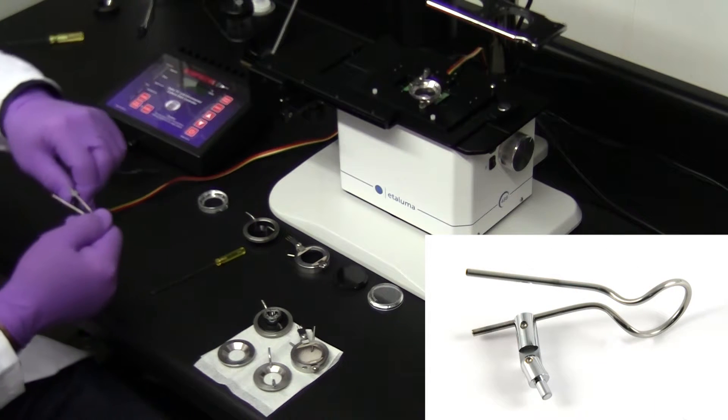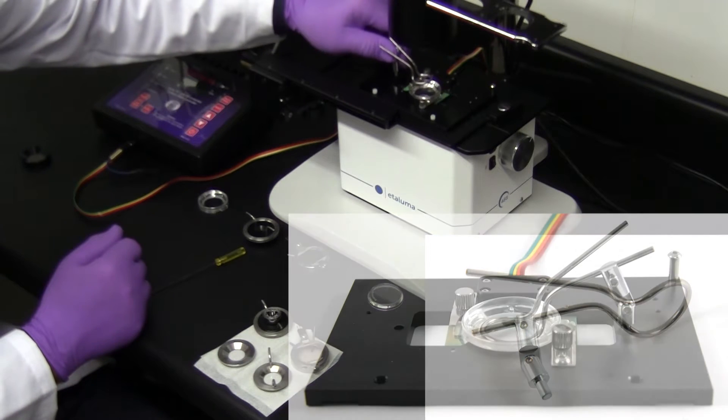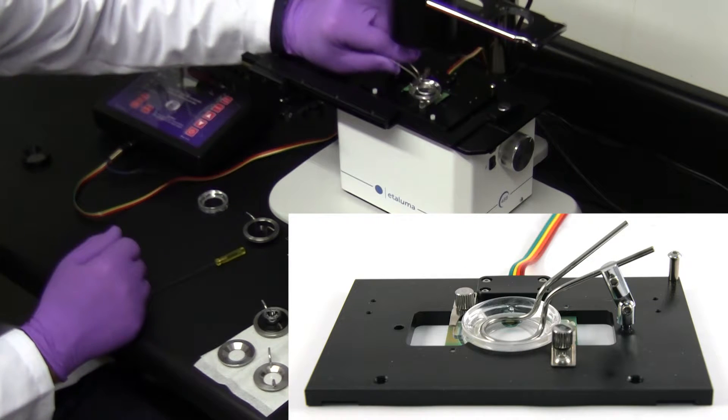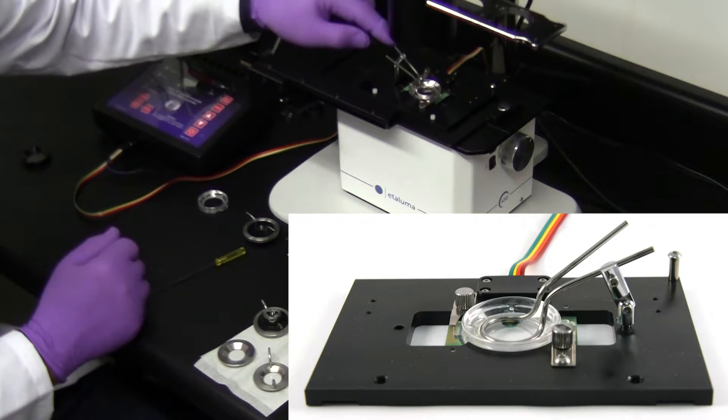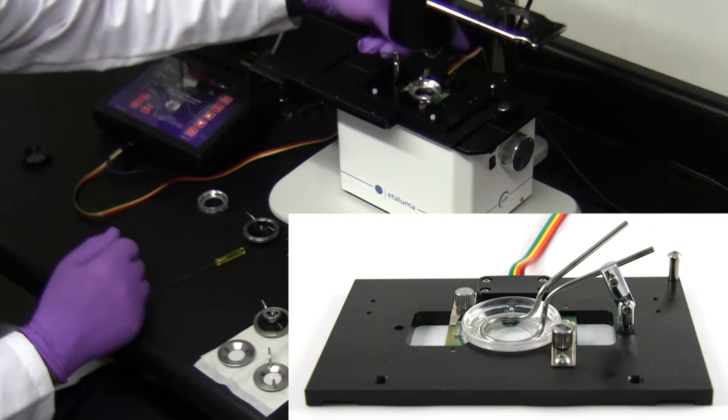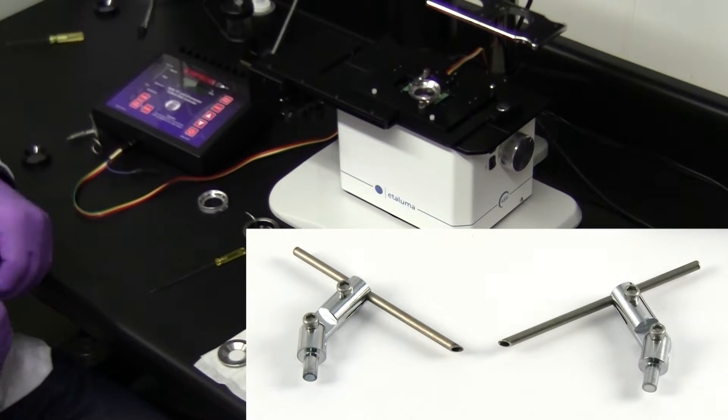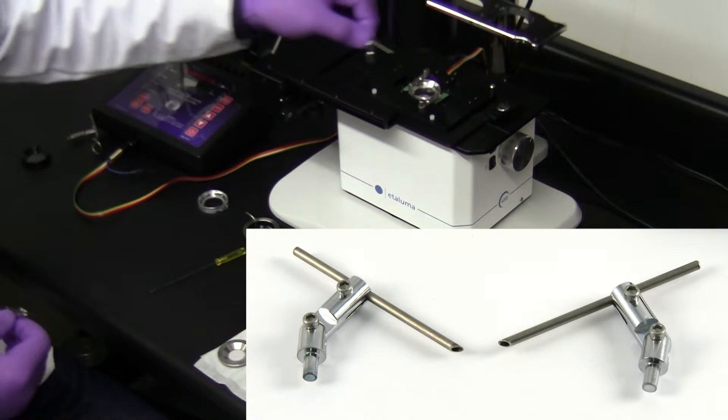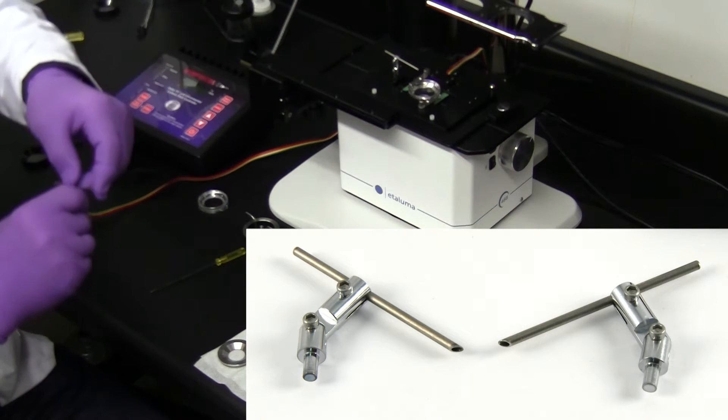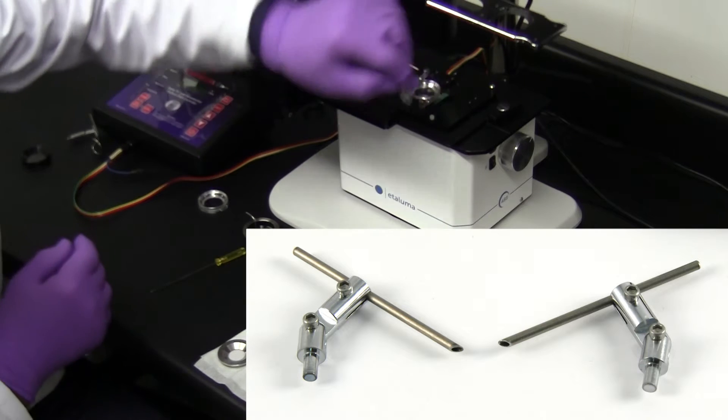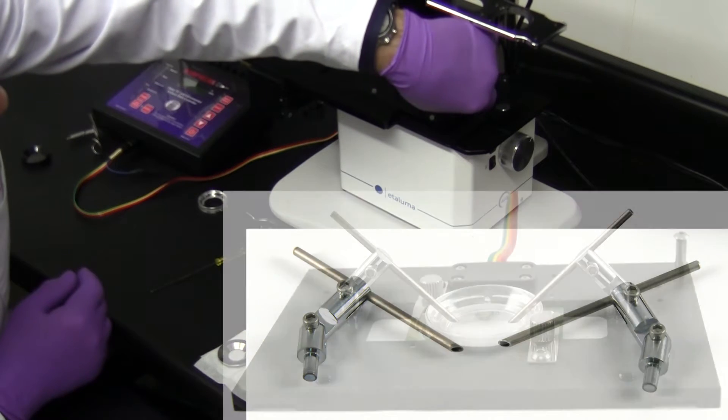For customers that need to cool their specimens, a simple cooling ring can be mounted to the stage adapter and flipped into the dish. Coolant lines are then attached to the reusable and autoclavable ring. When a dish is to remain open to the atmosphere and the customer needs to perfuse the dish, these handy hinged perfusion needle supports are used.